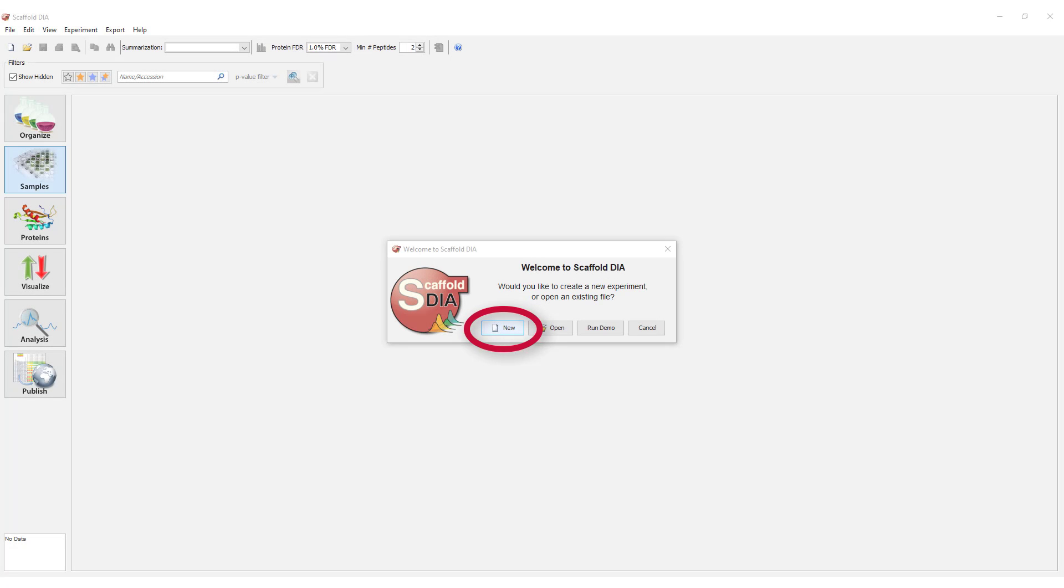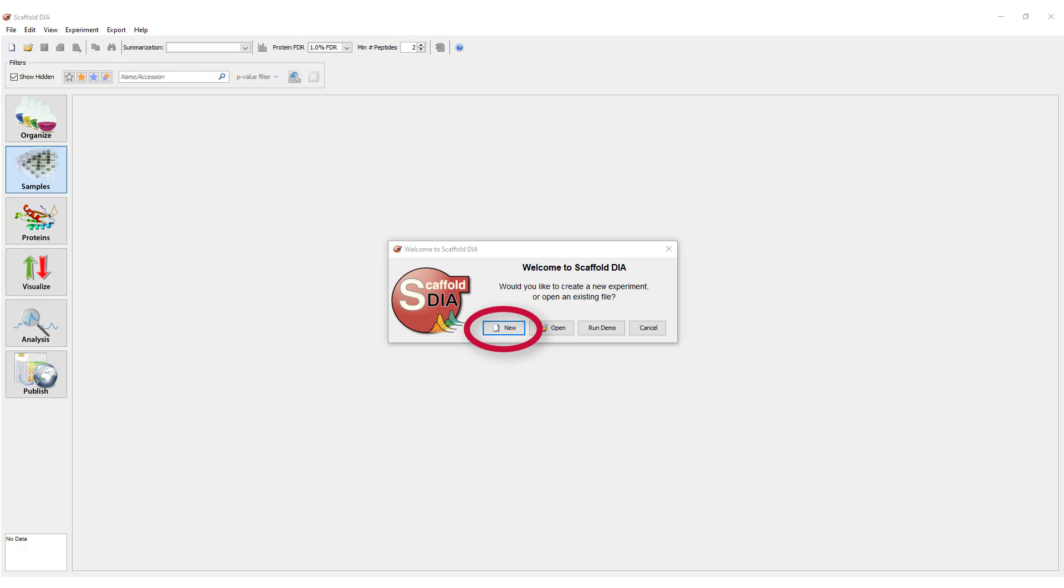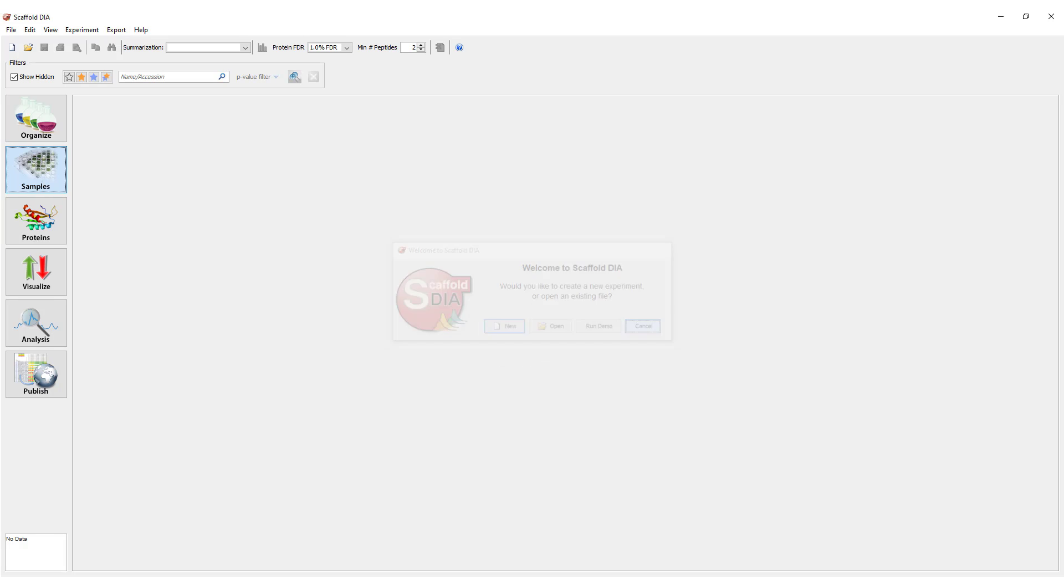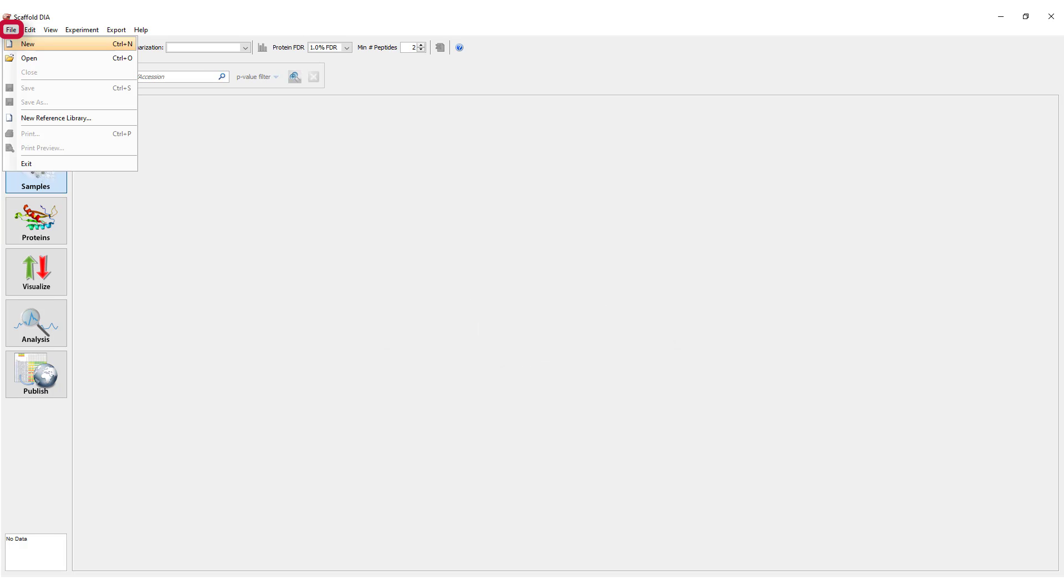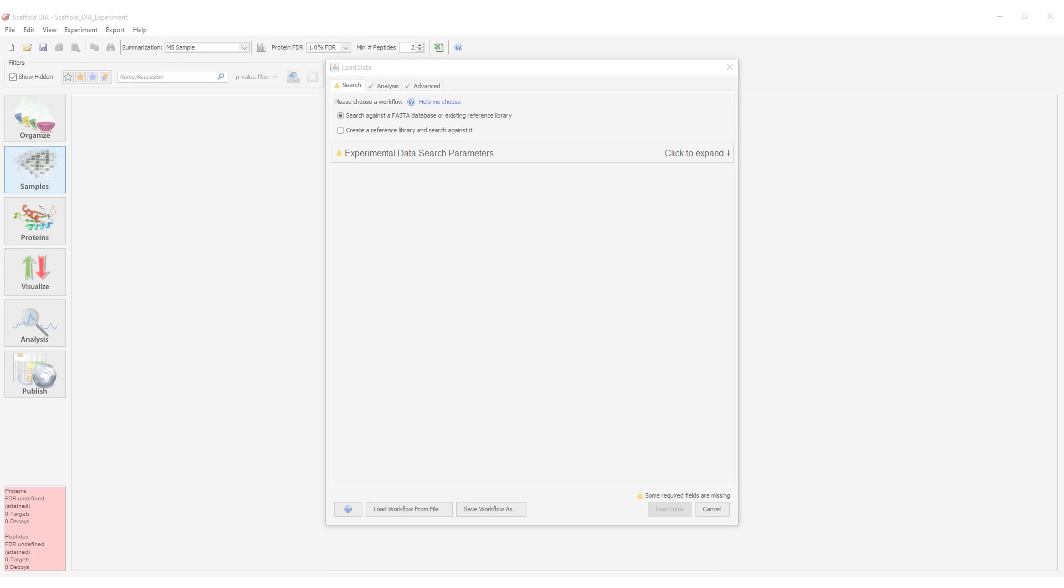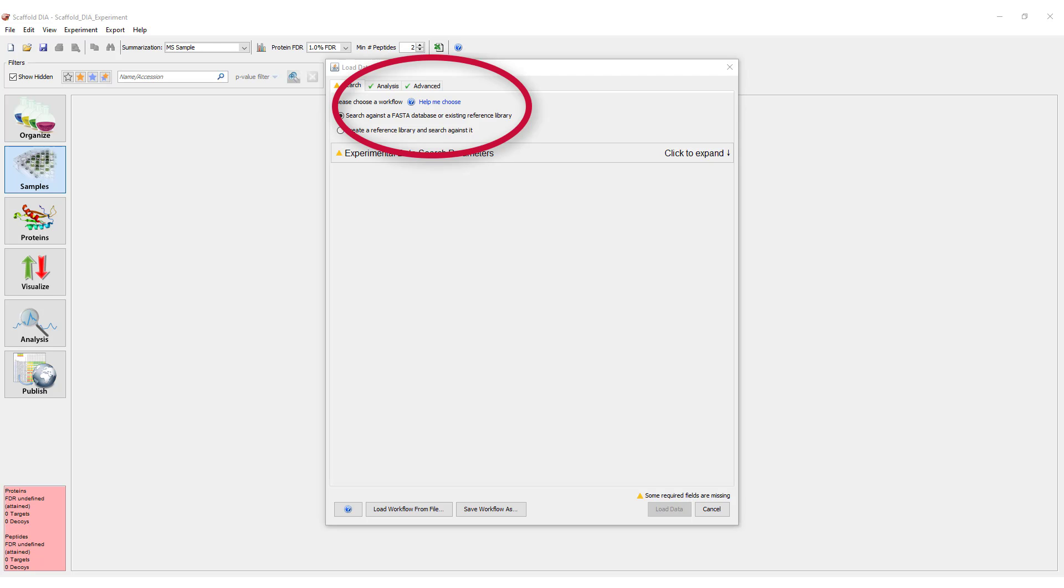The new file icon can be used to create an experiment and is found on the welcome dialog displayed when the program is launched, the file drop-down menu, or the toolbar. For more information on loading data or to access the in-program help guide, click on the Help Me Choose button scattered throughout the load data workflow.